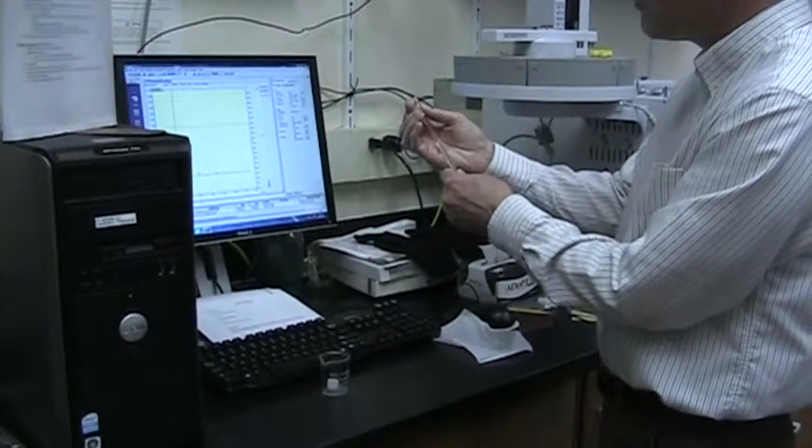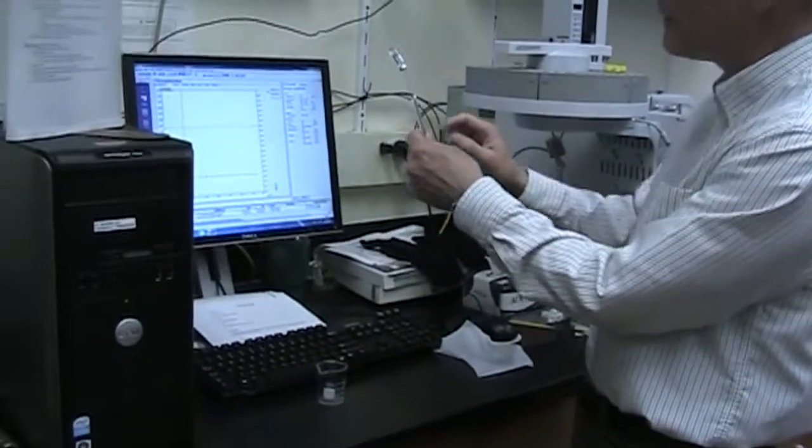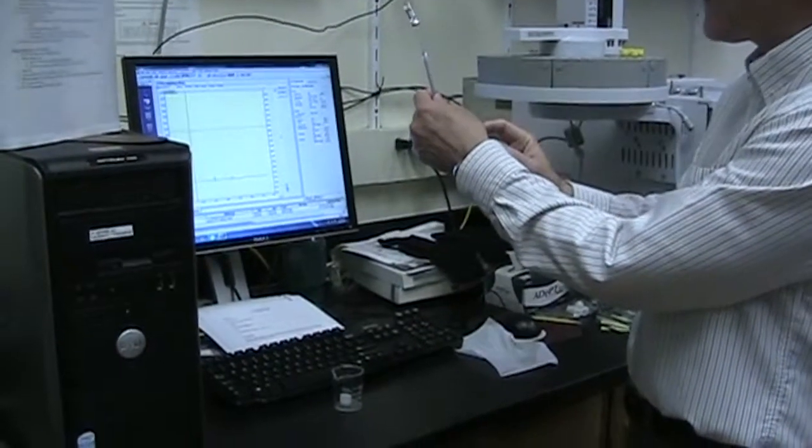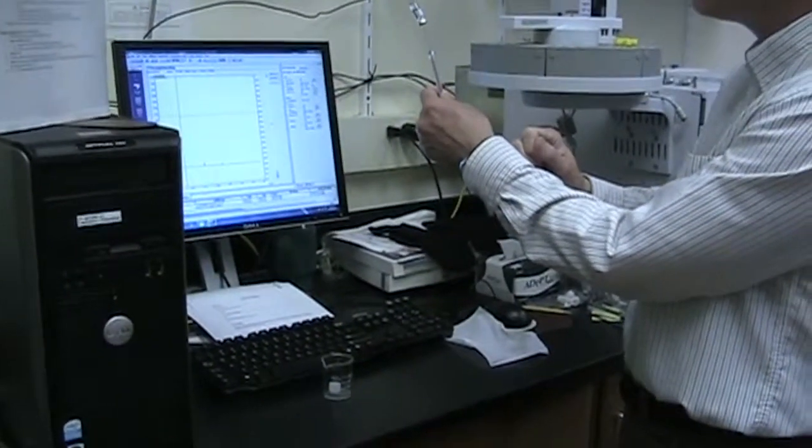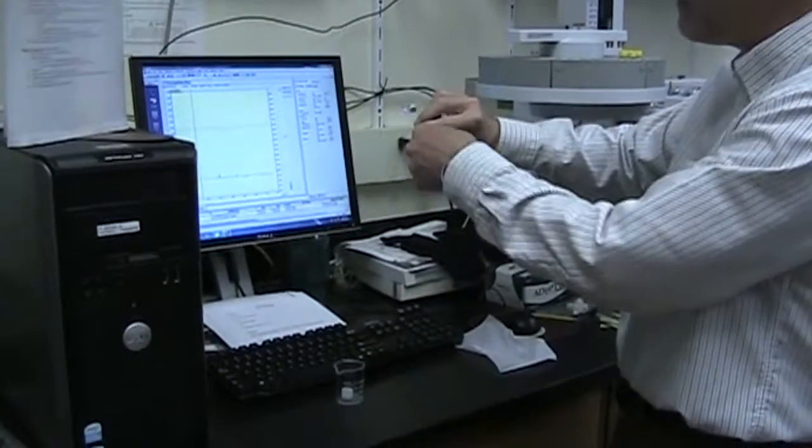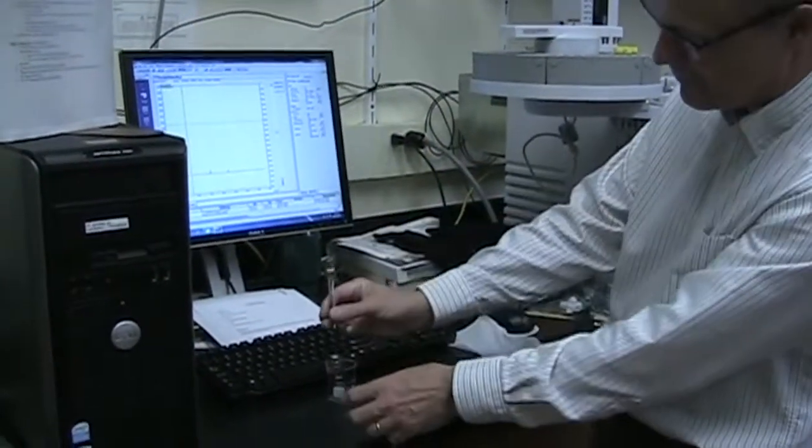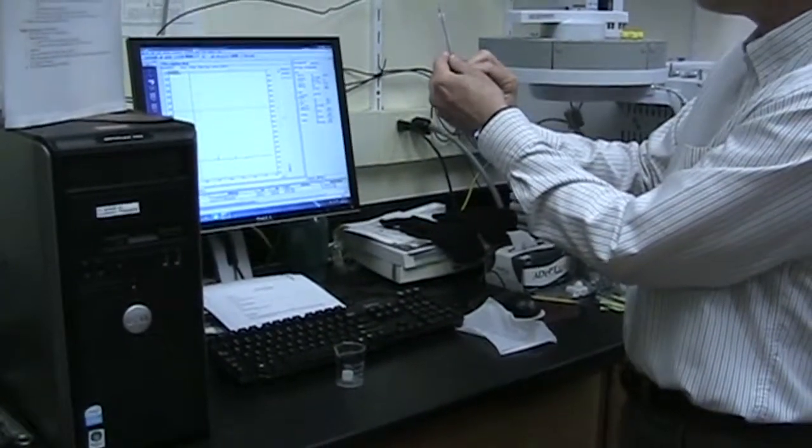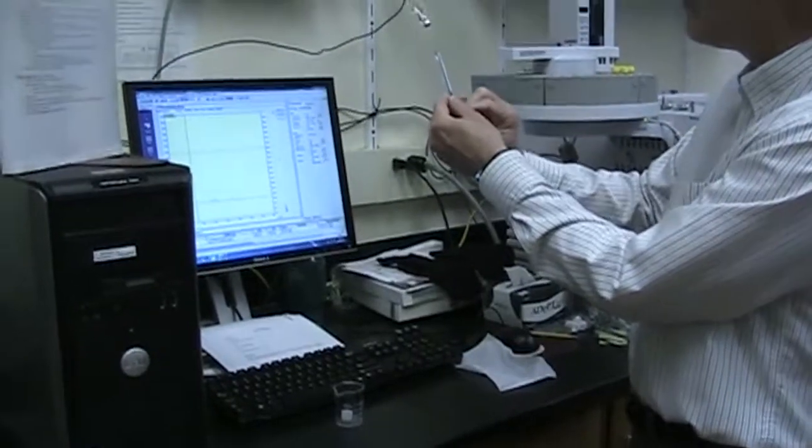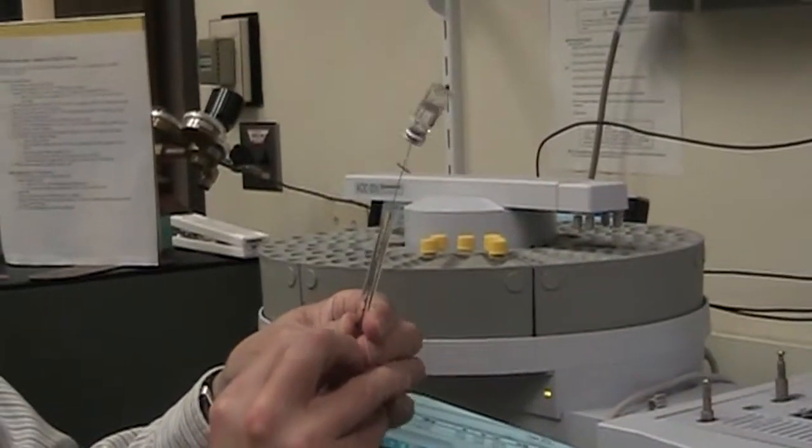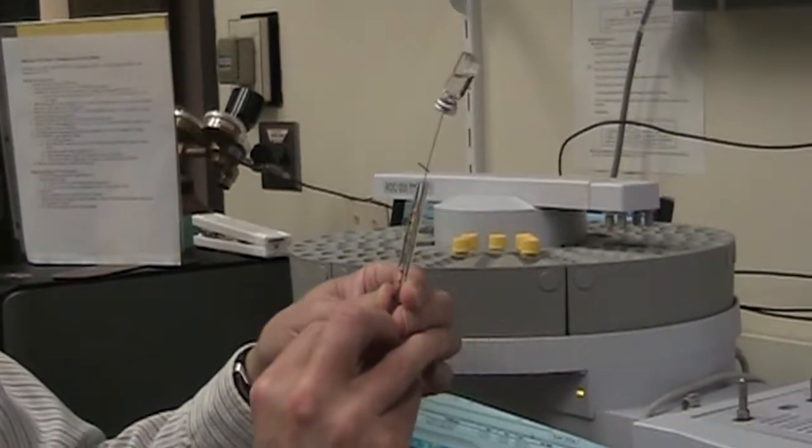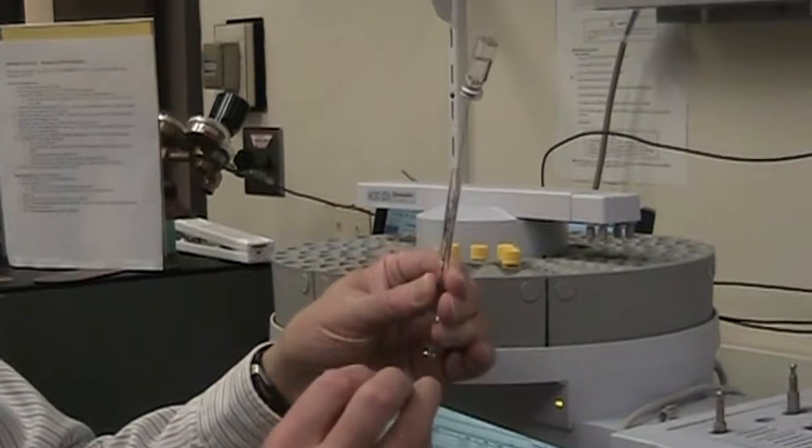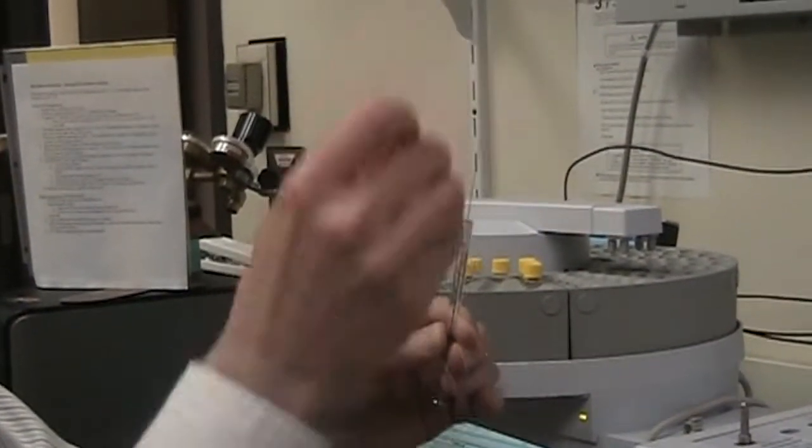So now I'm just putting the tip of the syringe into the vial, pulling it upside down. But the key part is the syringe tip is in the liquid, not in any air. Just want to pull liquid into the syringe. You could do the same thing kind of in the other direction. If you have a volumetric flask, you just put the syringe down. So again, we don't want any air. So typically pump this a little bit, get rid of any air bubbles, and then pull the barrel of the syringe until it's equal with the one microliter mark on the syringe barrel there.